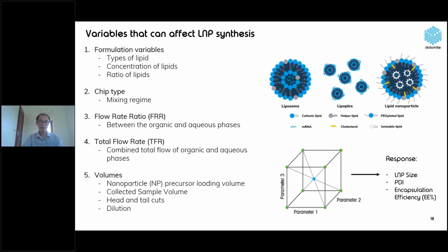And finally, the variable is the volume. So with nanoparticles, the precursor loading volume, or the collected sample volume, or the tail cut, or the dilution. So all of the variables will be reflected in the results like lipid nanoparticle size, PDI values, and encapsulation efficiencies.